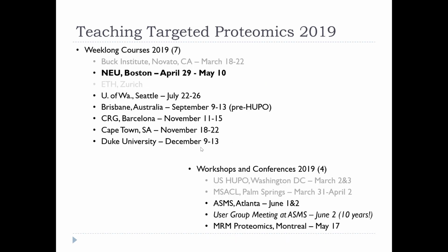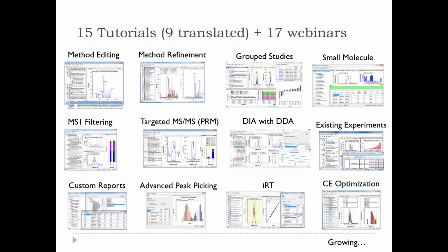However, in 2019, unfortunately, with Ruedi moving toward retirement and some key people leaving his lab, ETH is not going to have the DIA SWATH course, and so this becomes our only fully dedicated DIA session that you're at right now. But certainly, a number of these others have DIA material in them, and if you come to them, they're great places to learn more about Skyline and targeted proteomics.